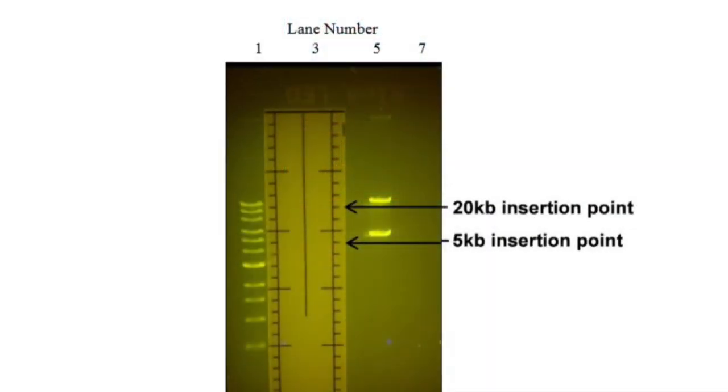To use ElectroCEP, run a gel for approximately 45 minutes with DNA references, such as a ladder.